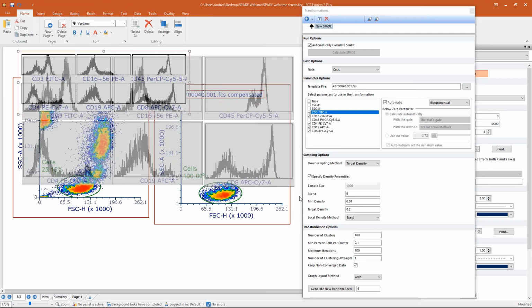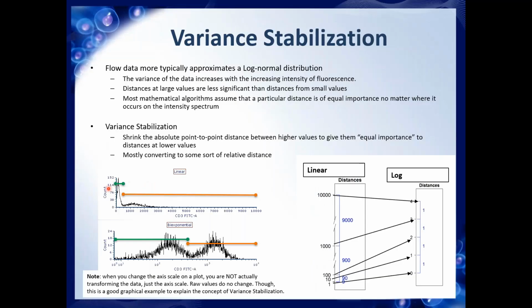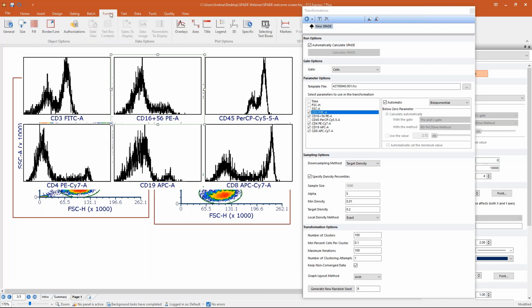So what you need to look at here is whether or not your peaks, positive and negative, are comparable. I mean, not in terms of frequency, but comparable in terms of variability, in terms of shapes. And you see, I cannot see anything really bad here. Remember, this is bad, okay? Because there is a huge difference in terms of spread between the negative and the positive, while in this case, they are pretty comparable.